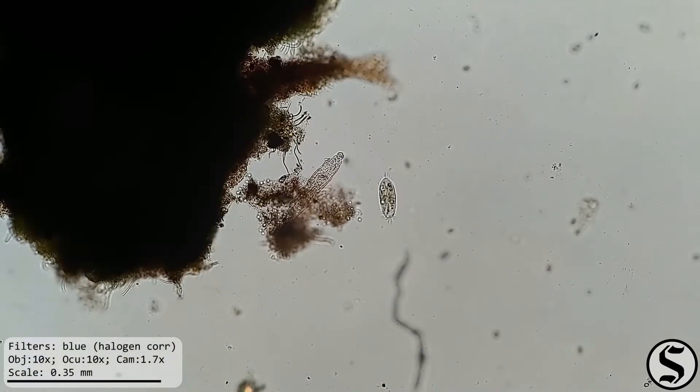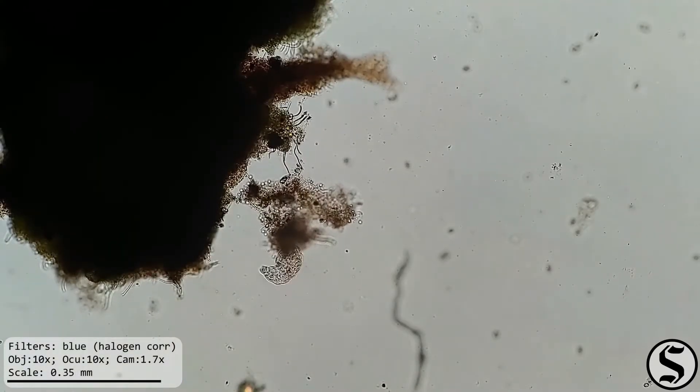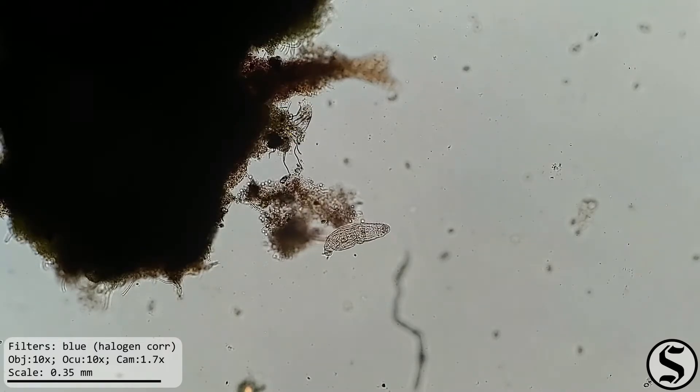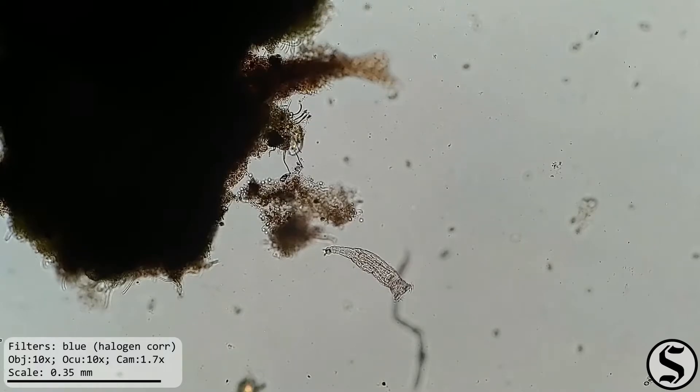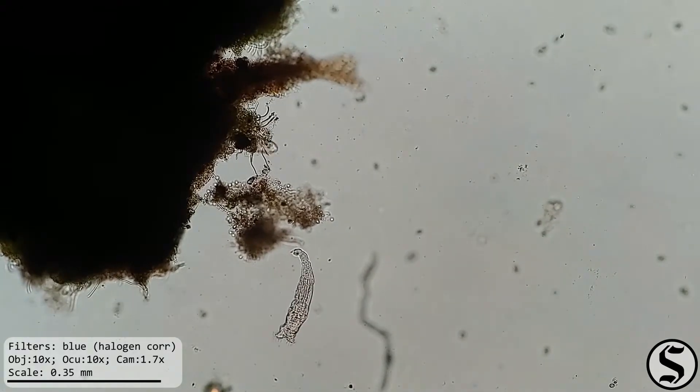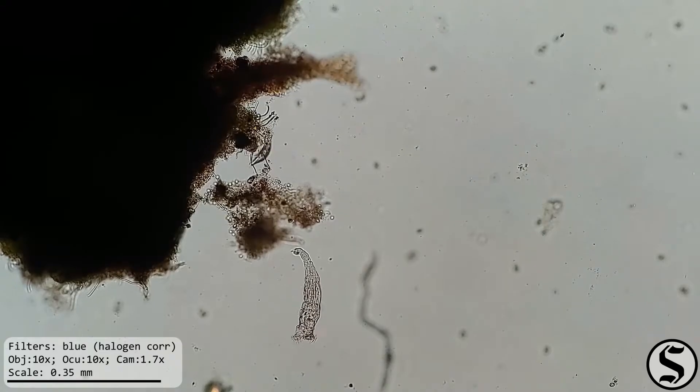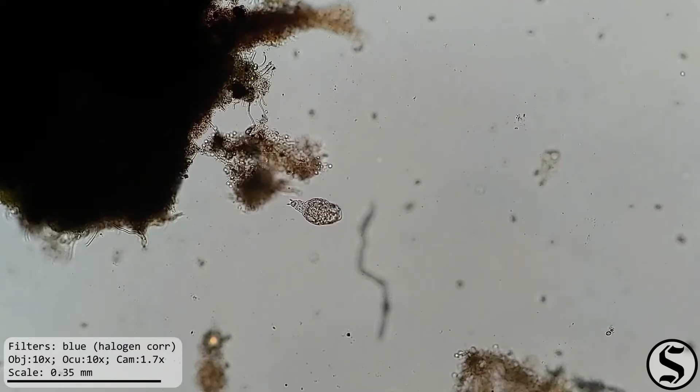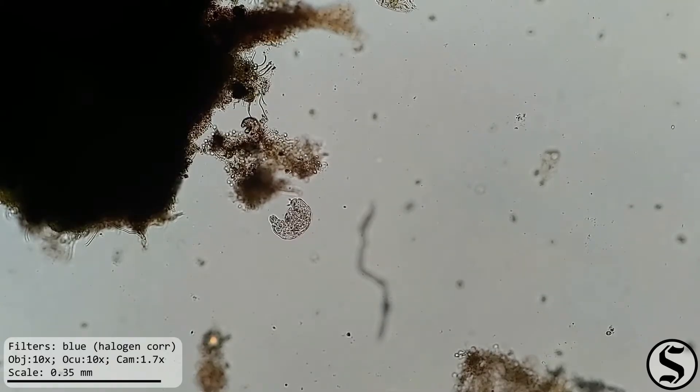He seemed to be kind of unhappy with his original location, so he started moving around. That right there is a classic rotifer shot so you could get a good look at him. Anyway, he seemed to not be particularly pleased with any location.